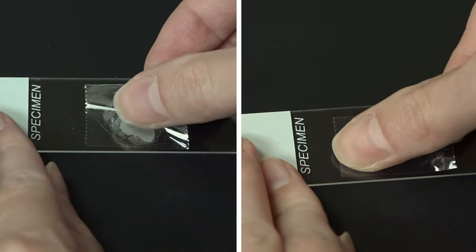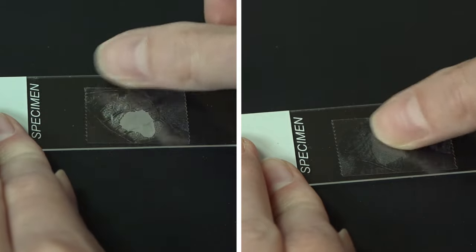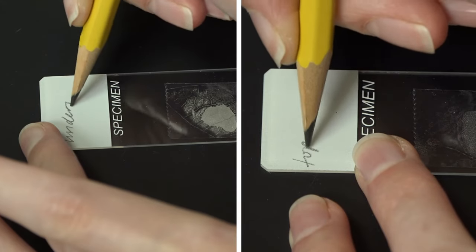Then I simply stick it on a microscope slide, label it, and we're ready to observe some stomata.